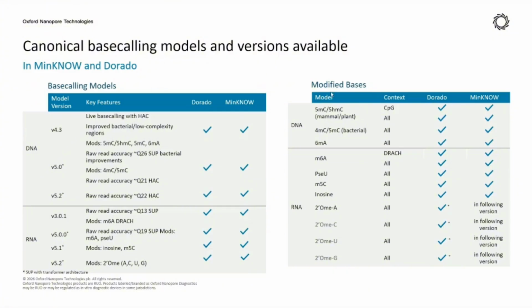And this can be directly observed in the sequencing data after base calling. Different base calling models or versions will provide different accuracies in terms of the methylation information gathered from the data. And if you are running a transcriptome using native RNA and you would like to also know the epigenetics of the RNAs, even more epigenetics information can be obtained. So this is just to touch base a bit before we go into the EPI2ME data analysis.